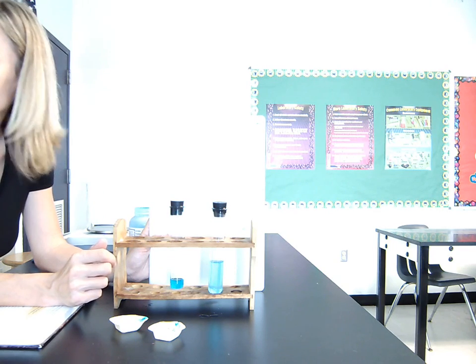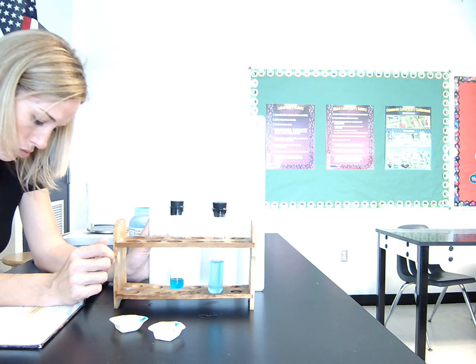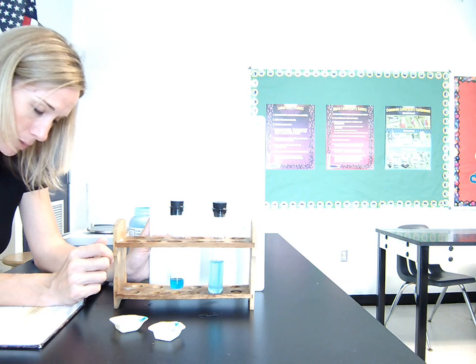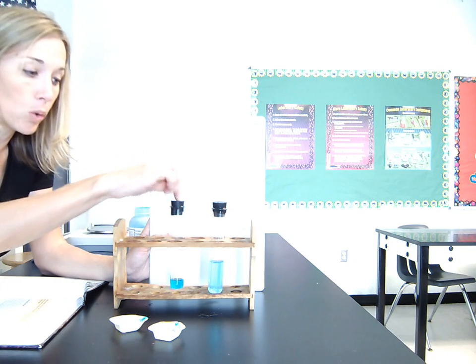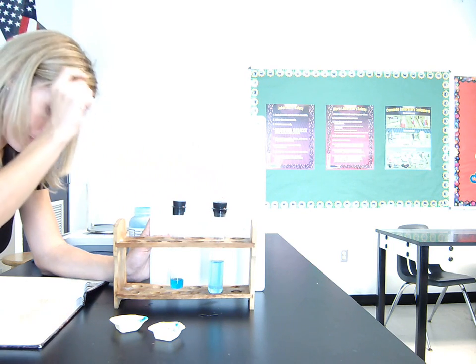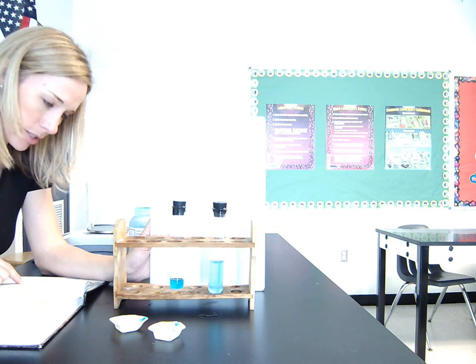That's obviously an important one because I spent a lot of time on it. So we'll come back to that throughout the whole chapter, actually. All right, the third blue dot says both tubes contain the same amount of dissolved material. What that means is I put 0.15 grams of blue stuff here and the same amount of blue stuff here. But the question goes on to say, is the shade of the color the same?